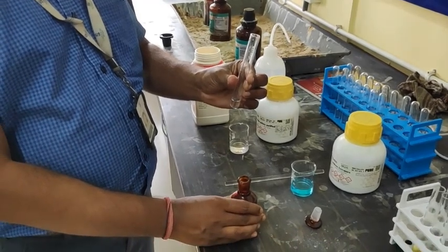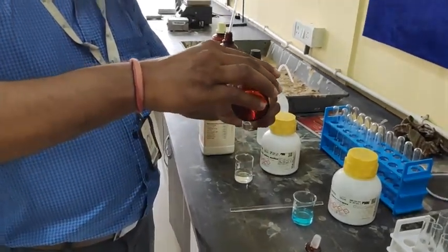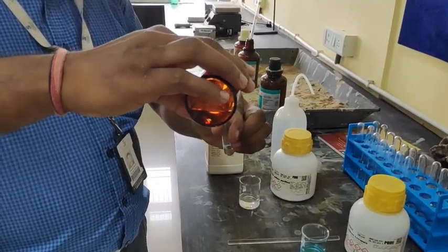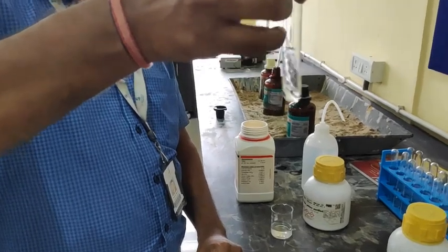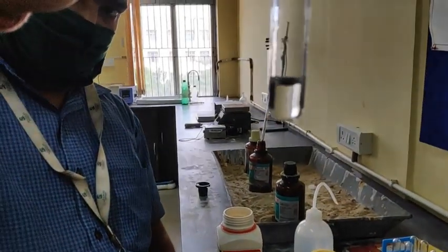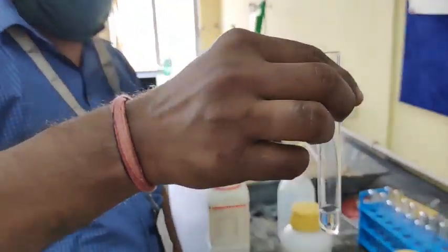Now the same reaction is being repeated in case of a blank. As a blank, we have just water present. Now he is adding some amount of ammonium sulfate solution. As this is water, see, the water remains as it was. There is no change in the transparency.